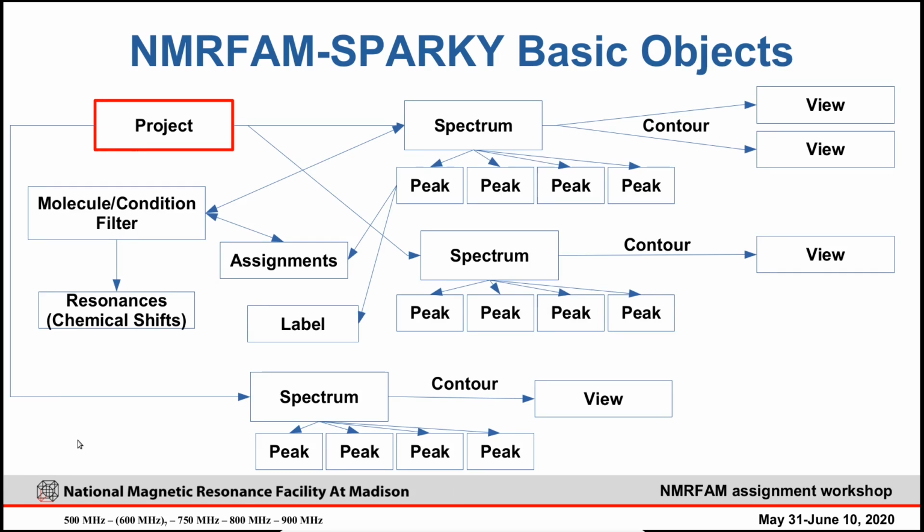and besides the project and spectra, you will get to know about view settings. For one spectrum you can make multiple views, but usually you will have one. But in case you want to go further, you want to see a different axis order, or for any reason you want to have another view with overlaid features, you can have multiple views in that case.